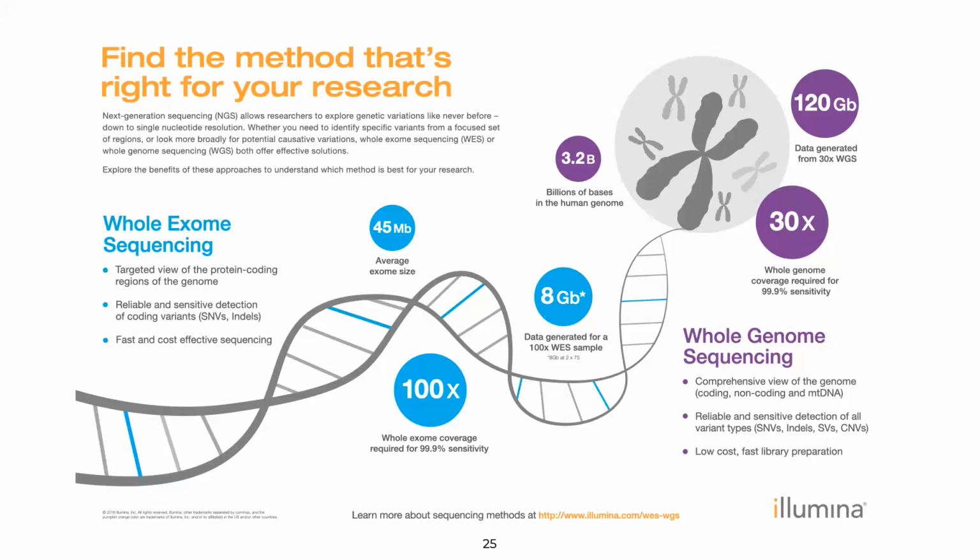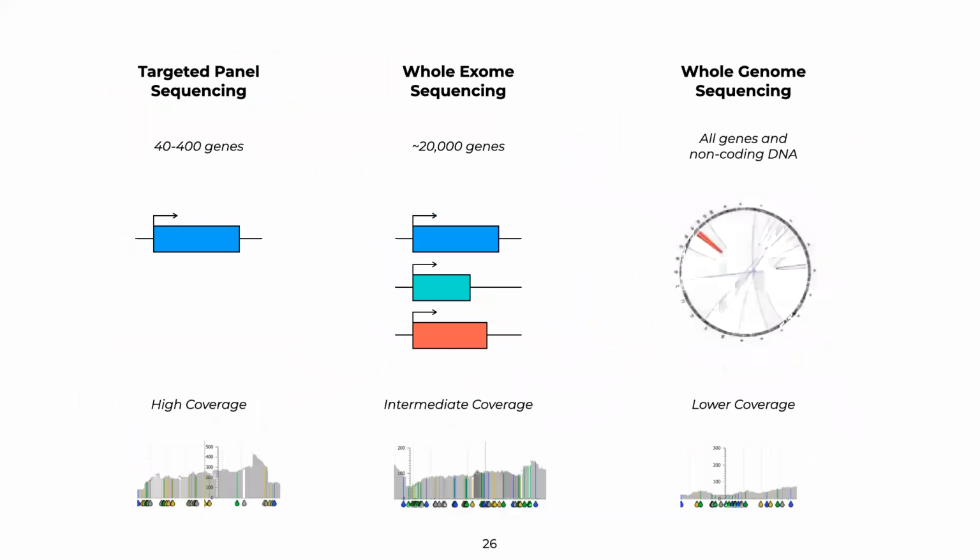And the final approach, an approach that is most widely accepted for clinical applications, for example, where identification of a mutation has serious clinical implications, is what's called targeted sequencing. And targeted sequencing means that you can have high coverage of that particular short sequence, maybe one or a panel of genes. And as a result, you have a very clear idea of what types of mutations are present and in which proportion. And we'll talk about that in just a second.